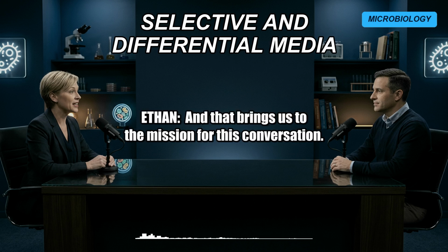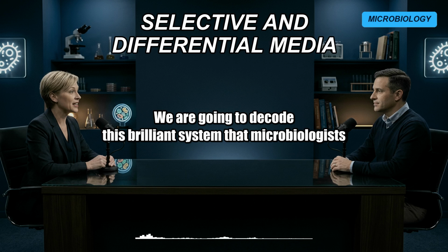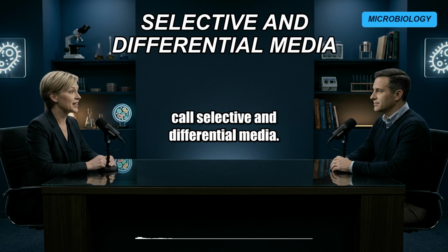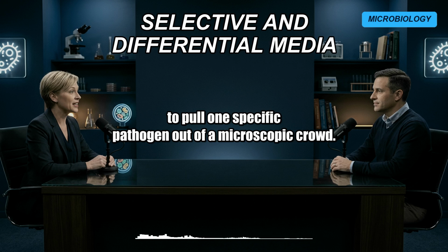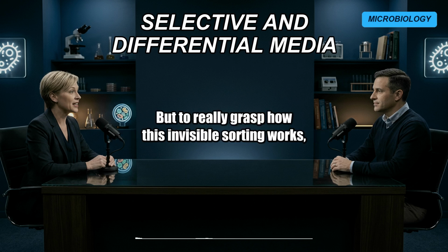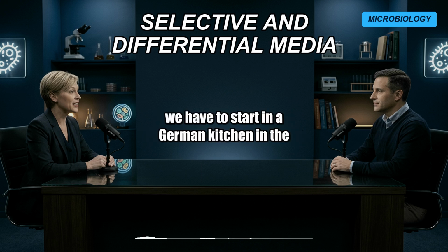Right. And that brings us to the mission for this conversation. We are going to decode this brilliant system that microbiologists call selective and differential media. We'll get into the incredibly clever lab tricks they use to pull one specific pathogen out of a microscopic crowd. But to really grasp how this invisible sorting works, we have to start in a German kitchen in the 1880s.